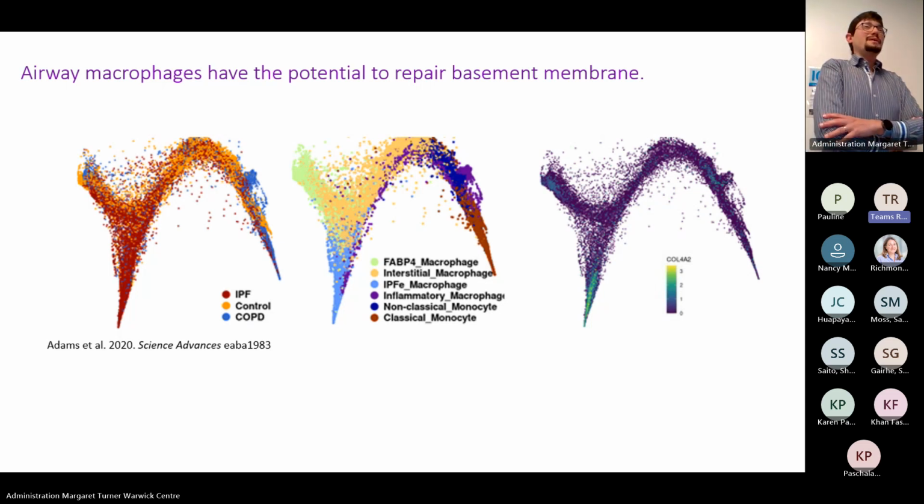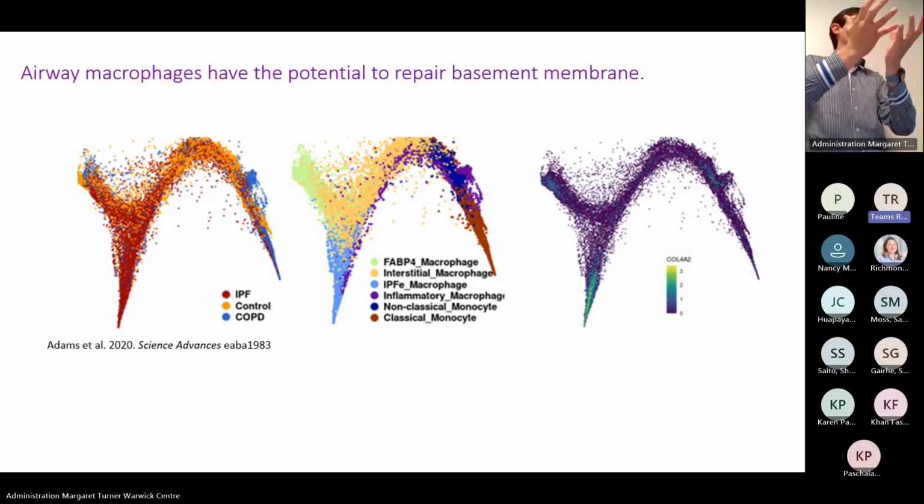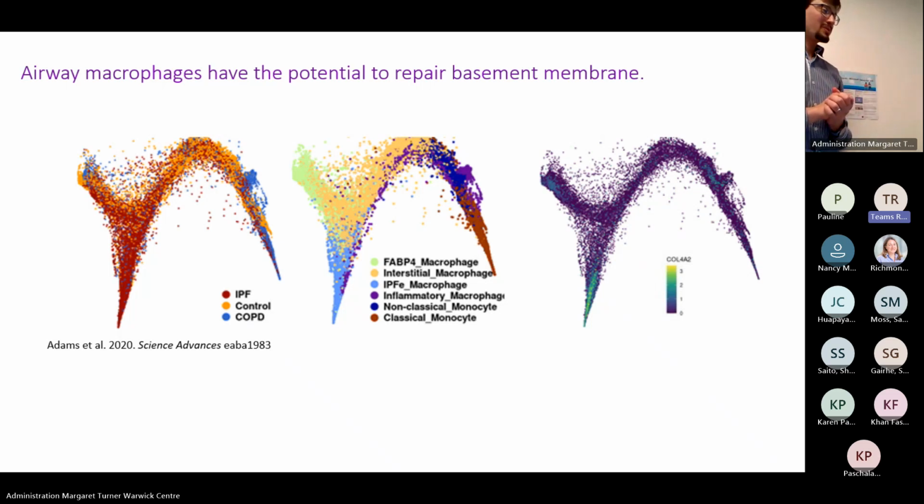And so I mentioned this to you before, we've got a PhD student starting in October, and their job is PLF 2.0, where they're going to be overlaying cleavage sites. Also, rather than representing the protein in 2D, they're going to be looking at it in 3D, with AlphaFold models or with PDB structures that have already been deciphered. And then we're hopefully going to be using a more machine learning approach to look at the patterns and how they might change.